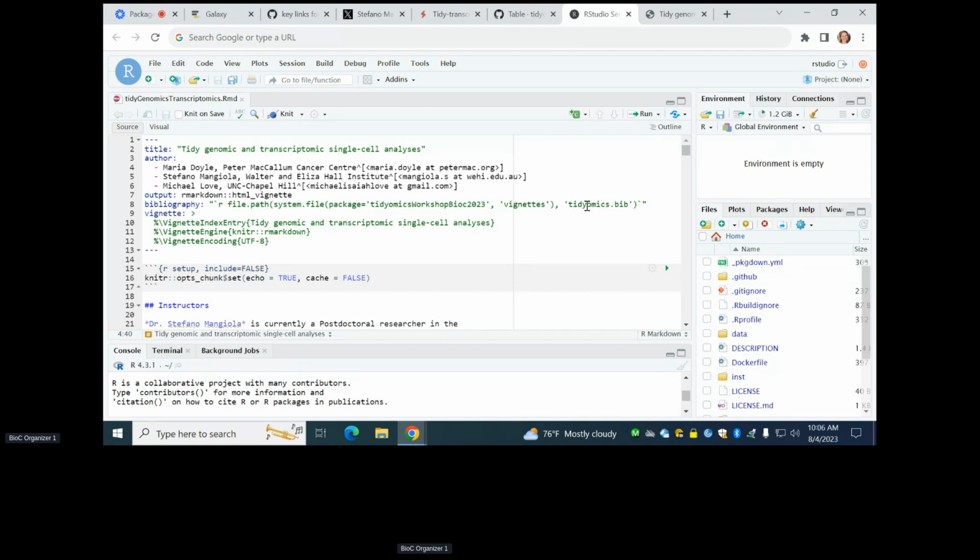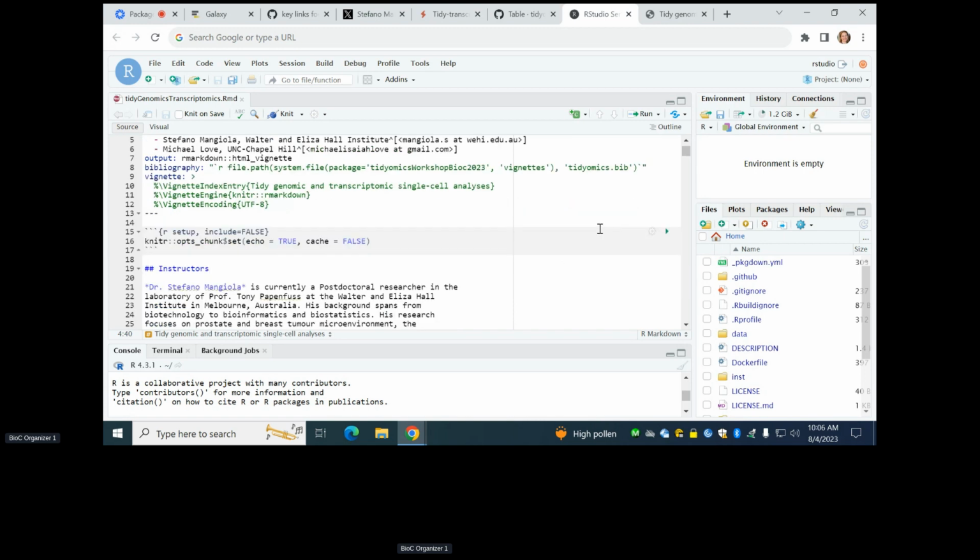Okay, good. So for everybody, you are in the right place. So we will do some introduction to these tools, but as well, Michael will go to how to integrate genomic and transcriptomic analysis through these tools. So, we cover all levels of interest, and the material here will be more details than what probably we will go through. So the material is also there for you to go through a second time and learn a bit more.